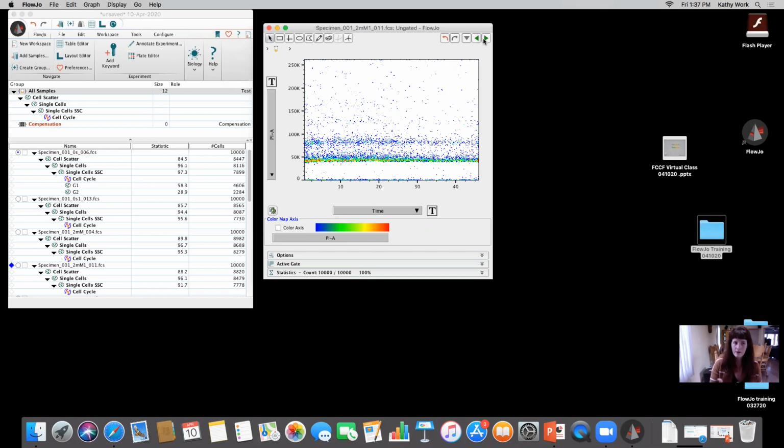For cell cycle, if you're just looking at PI, or you're just gating out the dead cells, excuse me, and then looking at PI or DAPI or whatever it is, you do not need to worry about an FMO, okay? That's going to be if you're doing a panel of maybe a couple of colors, there's some spread, and you're needing to better define positive and negative. Cell cycle is a little bit different, and you're looking at the linear data, typically in 1 or 2 parameters.